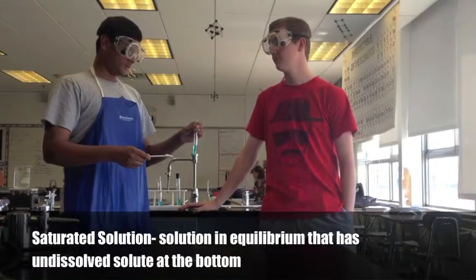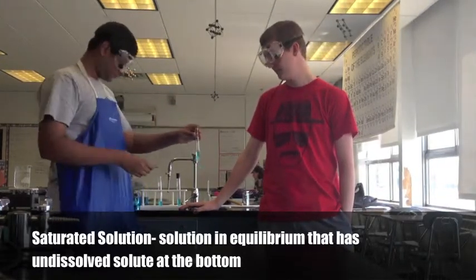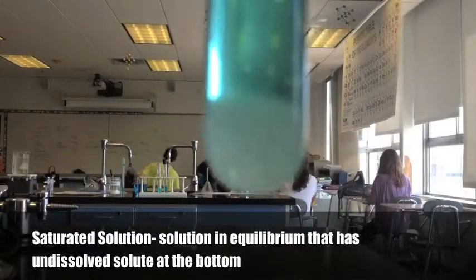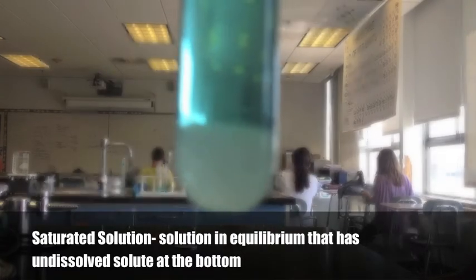Now we will be making a saturated solution. This is a saturated solution because after thoroughly mixing the solution, there are still sodium acetate particles at the bottom.